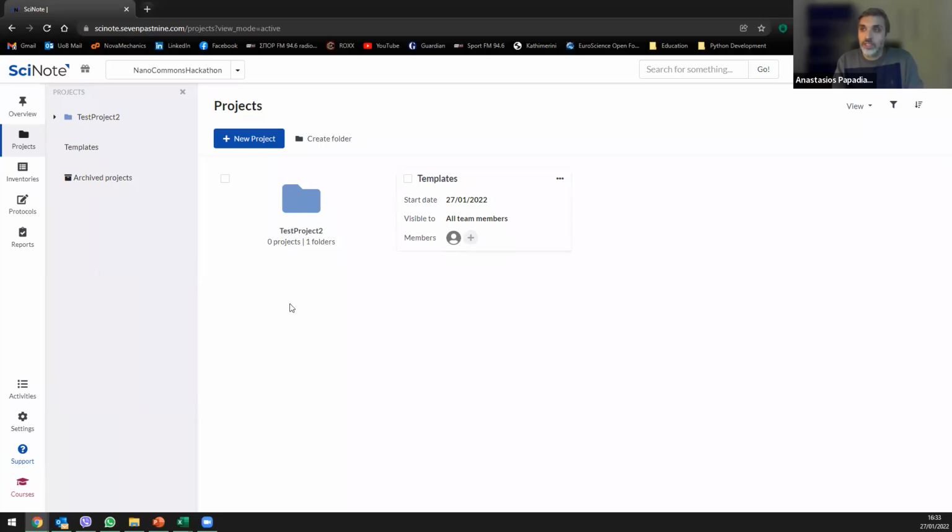Maybe you want a training instance where you can delete stuff so people can play with it, but for the actual work, you deactivate it so that, as Thomas says, you will not be able to do any data manipulation, etc. Not that this happens anyway.